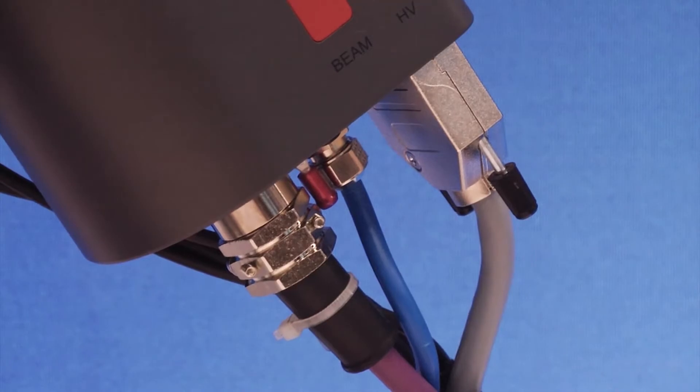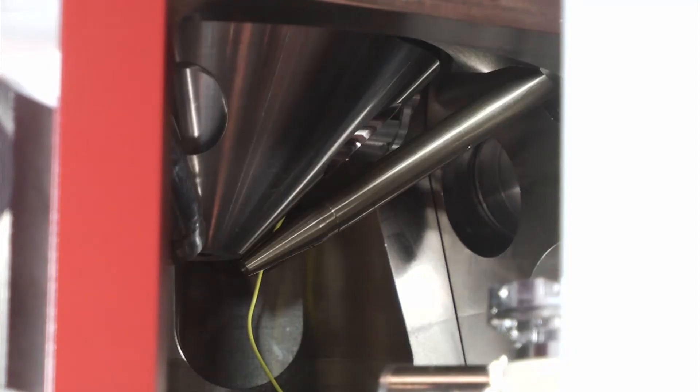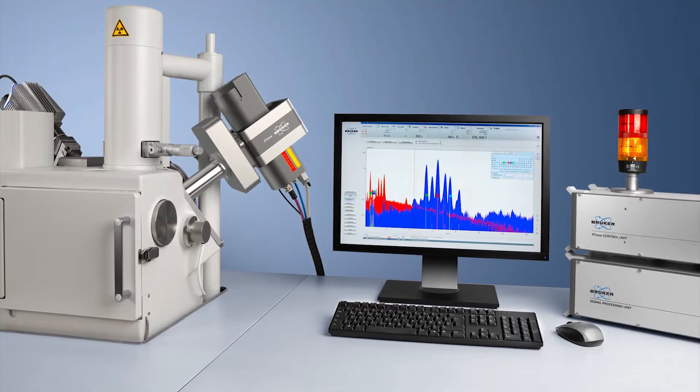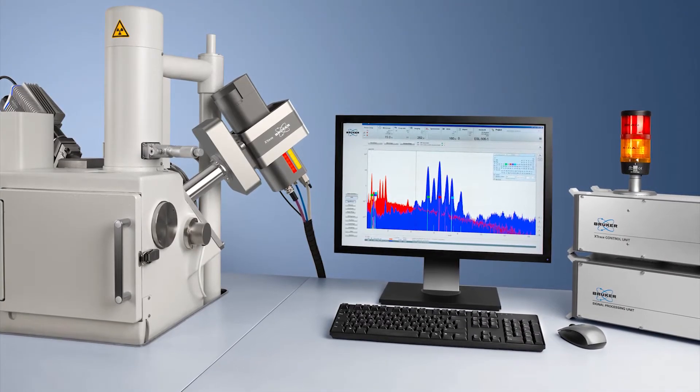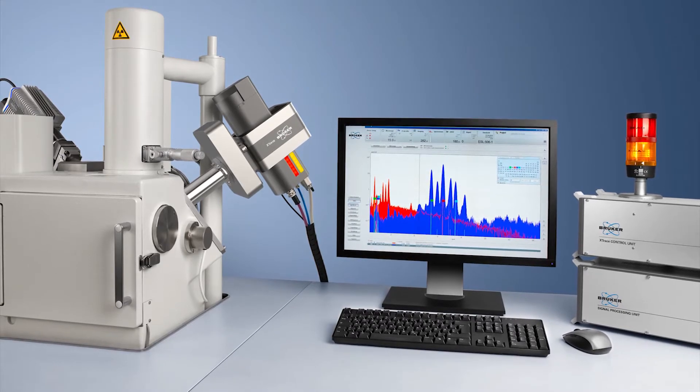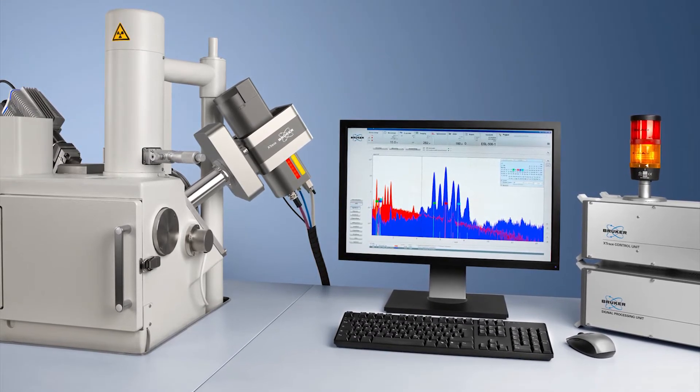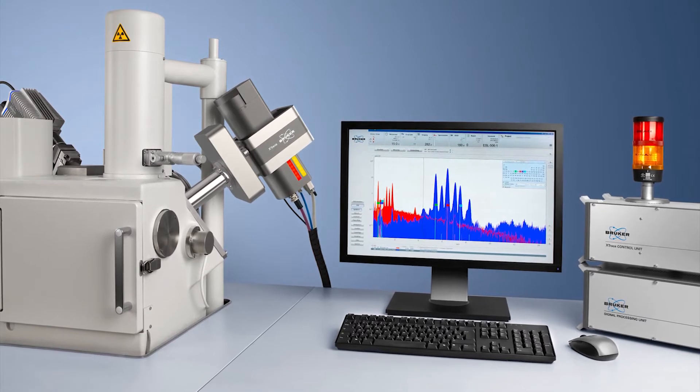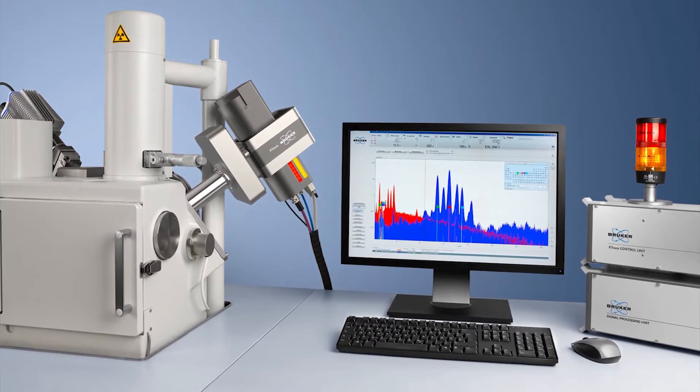Here you see our X-Trace microspot X-ray source on an SEM column. It consists of a micro focus X-ray tube and polycapillary optics. With molybdenum as target material, spot sizes smaller than 40 micrometers can be achieved.